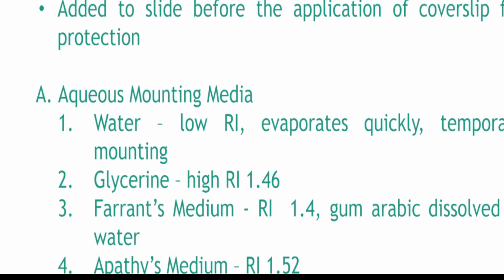Nothing is better. It depends on what type of laboratory you have, what type of clients you have, and what type of patients would require the usage of these types of media. So, for example, if the majority of your patients are like pap smears, I would rather you use aqueous media. Okay, if the majority of the patient population has cancers, and the slides that you are preparing can be viewed by future generations of pathologists and medical technology students, I would say you use a resin.